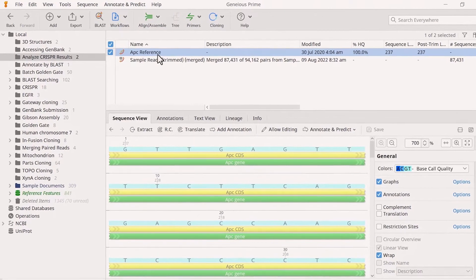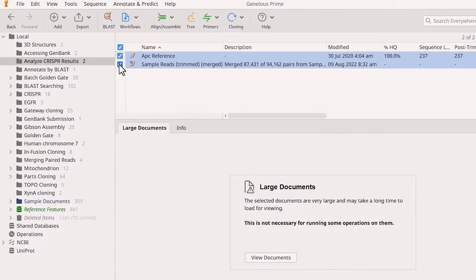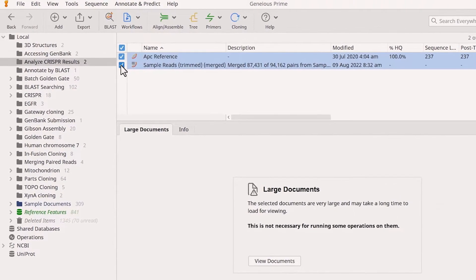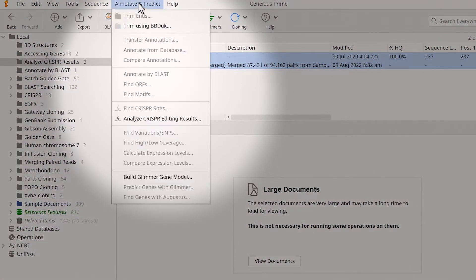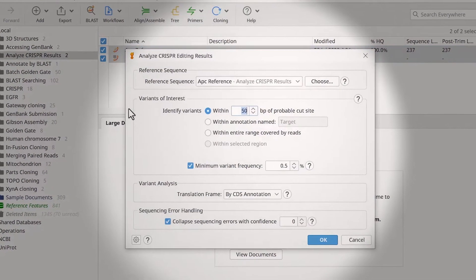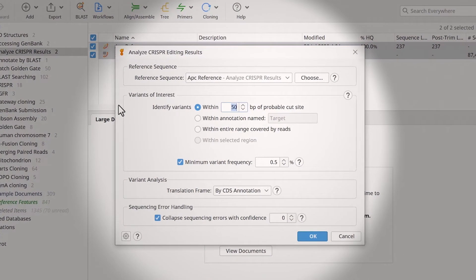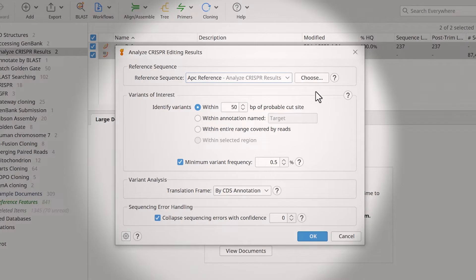Select this reference sequence and the file containing your sequencing reads. Go to Annotate and Predict and select Analyze CRISPR editing results. Geneious should automatically set the reference sequence. However, you can also use the drop-down menu or the Choose button to specify the reference sequence.